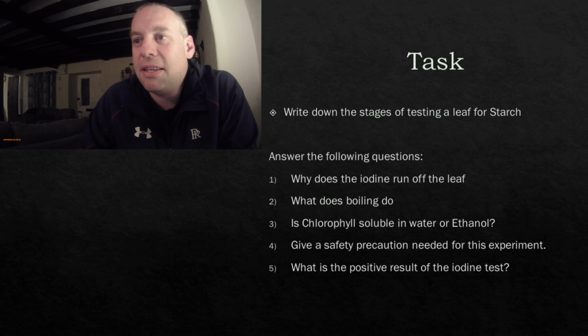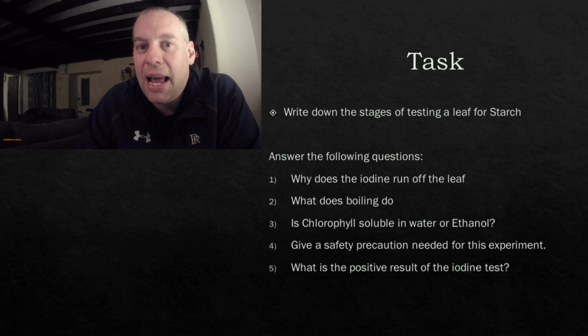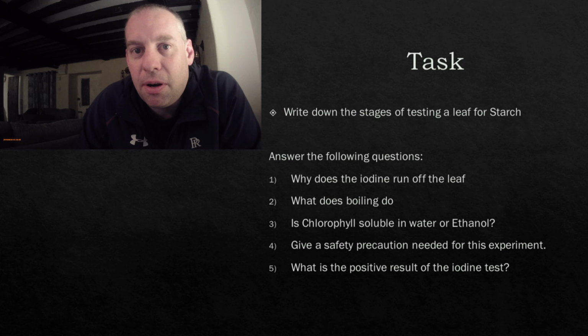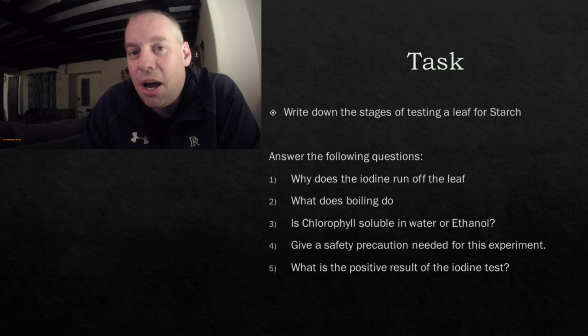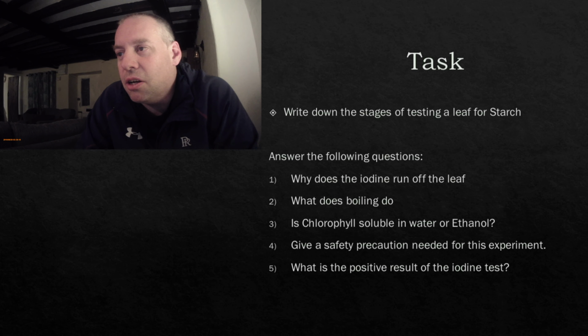Thank you, Mr. Kibax. So perfect. So you've now seen how to test a leaf successfully for starch. And although it's in the middle of the winter, when I think we filmed this, it was the 5th of January. It was a very cold day. I'm not at all surprised that the plant wasn't photosynthesizing like mad. Oh, it's a tongue twister.